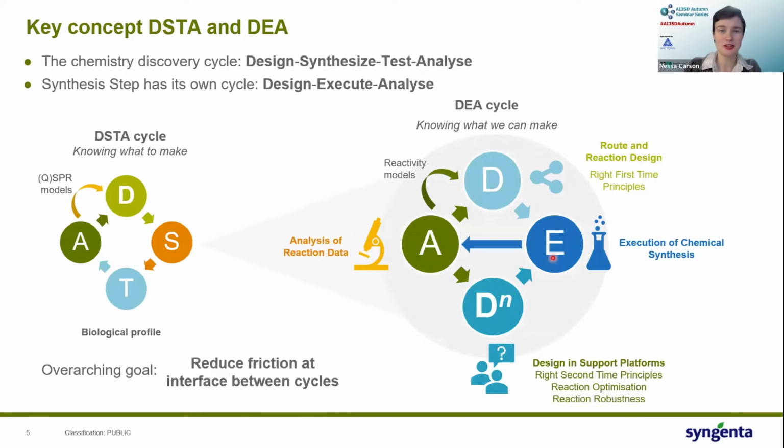So we're not generating compounds, which is a lot of what discovery chemistry is focused on. Most of the time, when I've finished running a 96-well plate, I will throw it all away at the end, which is quite nice. Don't have to purify or anything. I never like running columns anyway. So yeah, what I've made there is data for the company. I've not particularly, most of the time, contributed to registering compounds or making compounds. It can be done though.